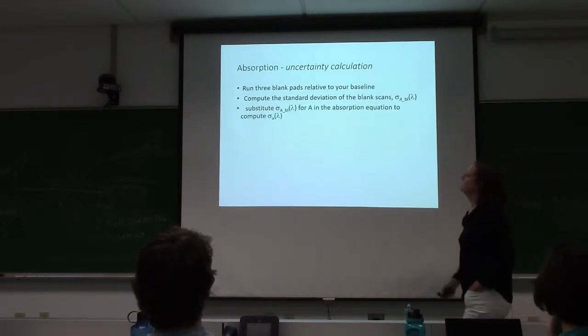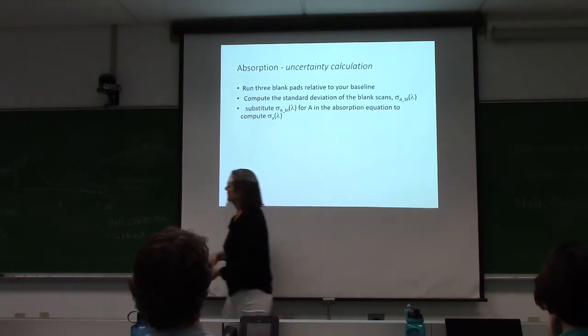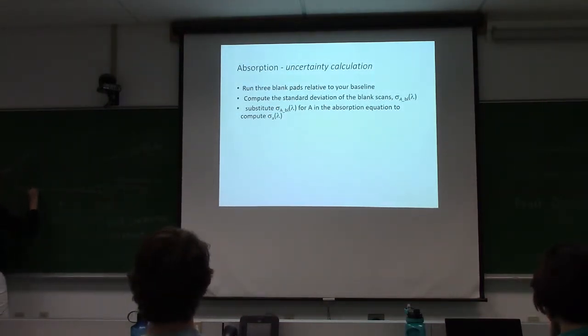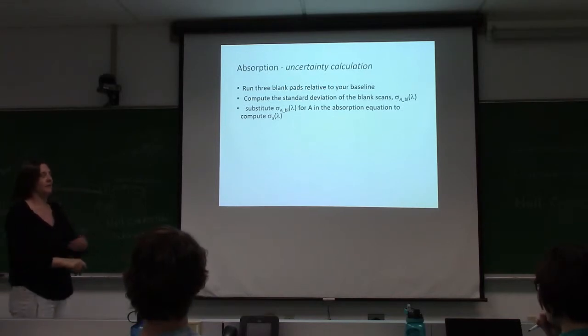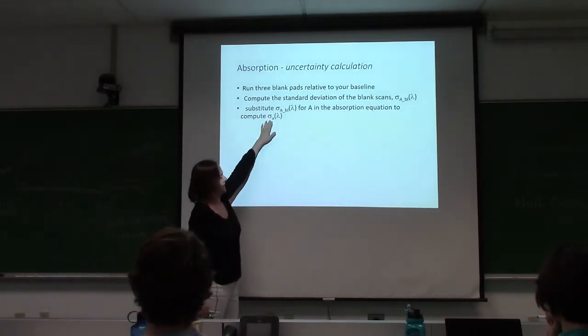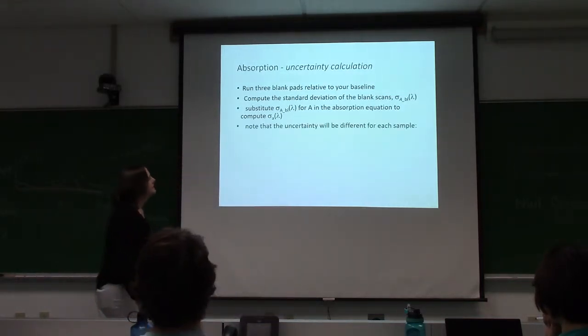It won't be. And then I take that standard deviation spectrum, which should look something like, this is what I want. This is what I often get. There's always junk going on in the blue because it's hard to keep organic matter out of anything. And so then I compute the absorption. I put it right through the whole equation. I do path length amplification. I do the whole thing.